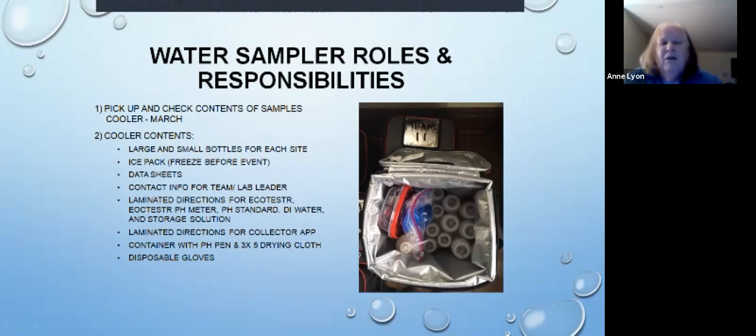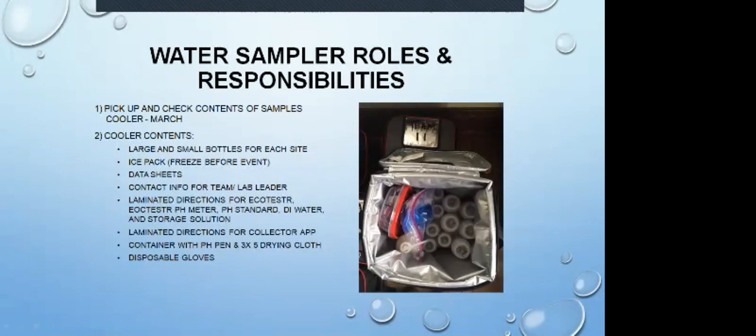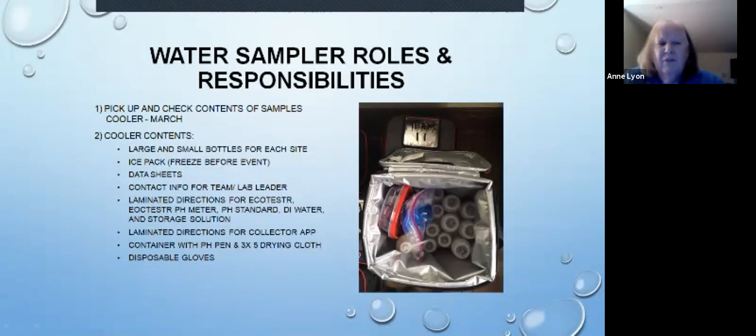We think the best place to put these coolers is at the Upper Mill Creek lab. They're only open during the day, so I'm going to send out a survey to the team leaders to find out if they can pick them up there, and if not, I'm going to make arrangements to have a pickup day on another date so we can get all these coolers to you. The cooler contents, you're going to have large and small bottles for each site.